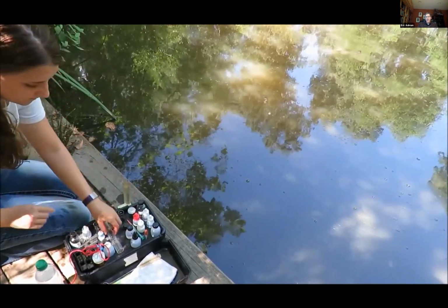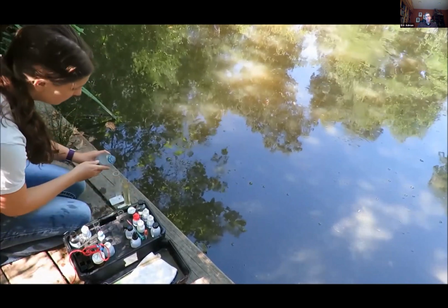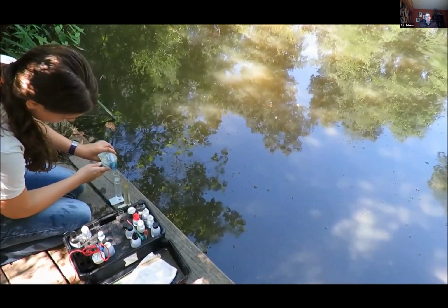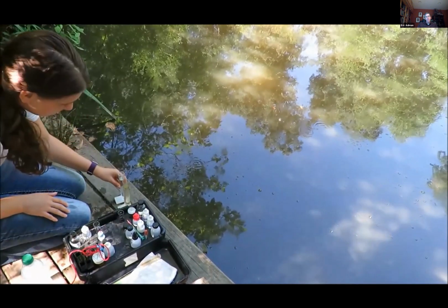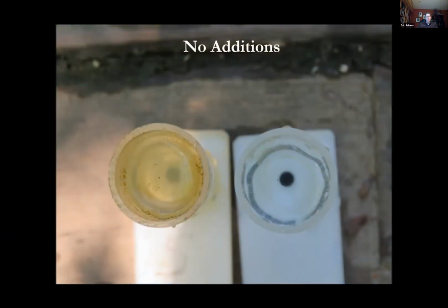Fill the second turbidity column with an equal amount of bottled distilled or tap water. This is your control column. It may be helpful to label one of the turbidity columns as sample and the other as control to avoid confusion. Place the columns side by side on a firm level surface and look down through them to compare the clarity or fuzziness of the black dots. Do not consider watercolor.